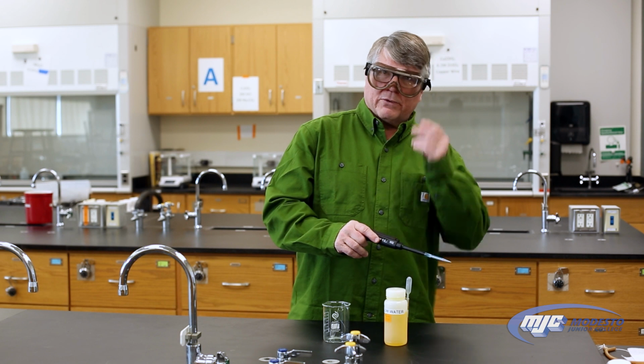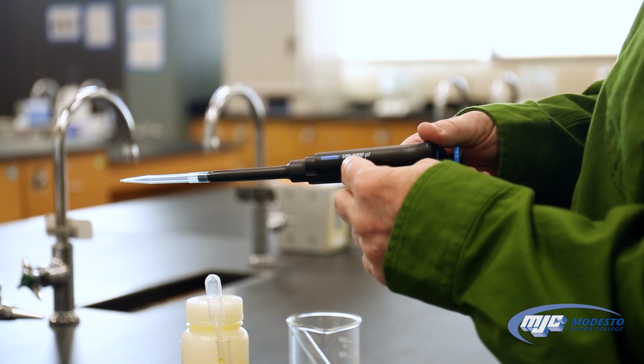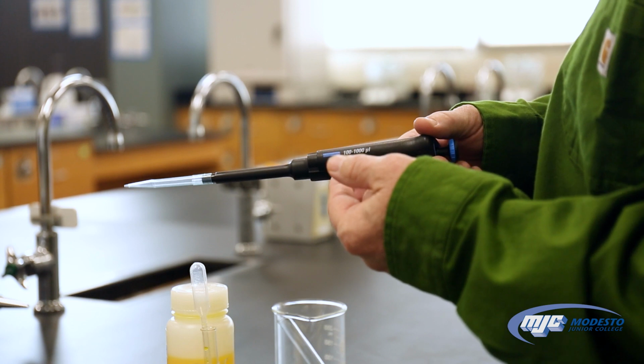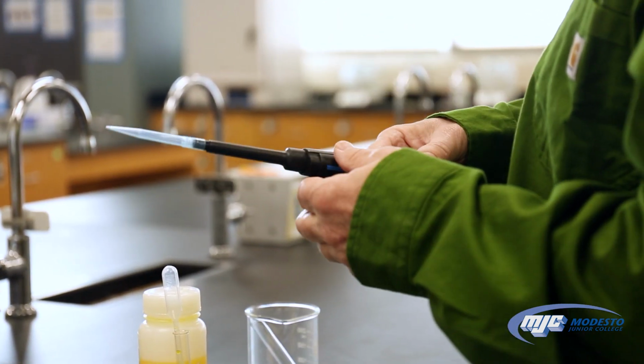This micropipette, which is the one we commonly use in our classes here, measures between 100 and 1,000 microliters, which is 0.1 to 1 milliliters. And it measures it to the nearest microliter, which is 10 to the minus 6 liters. So it's a really small amount.